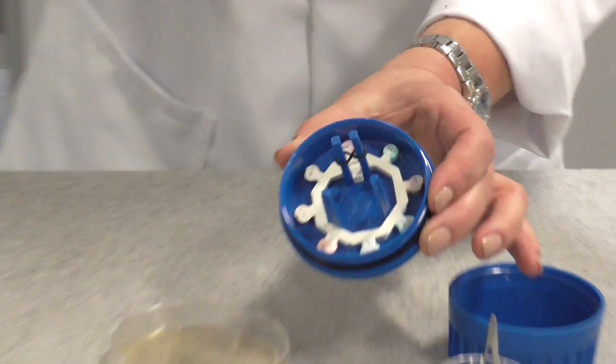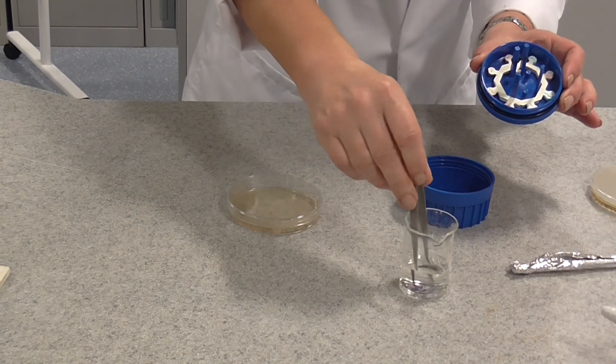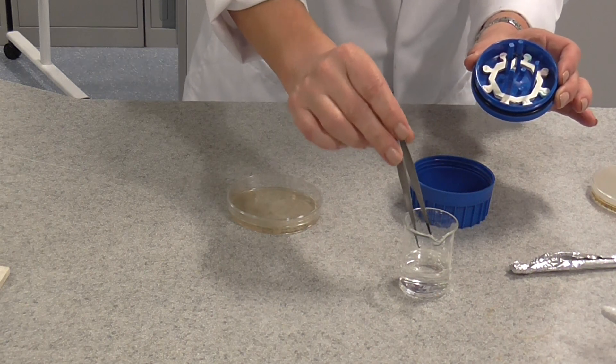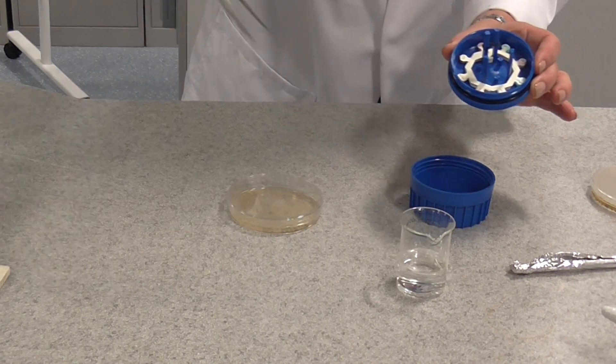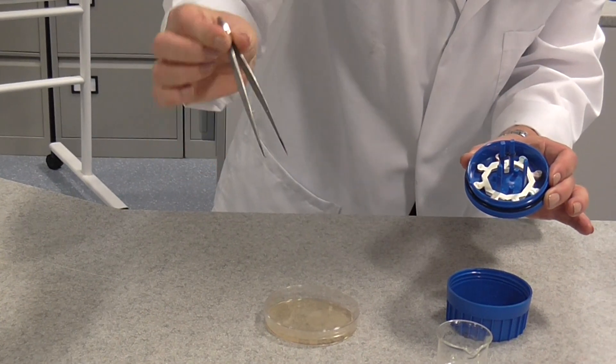Now I've got to use aseptic technique again to do this. So this time I'm going to use some forceps. They're in ethanol and I'm going to just flame them to sterilise them. So they've got some ethanol on them. Put those in your bunsen burner flame and you should see the ethanol there burning. And this will sterilise the forceps.